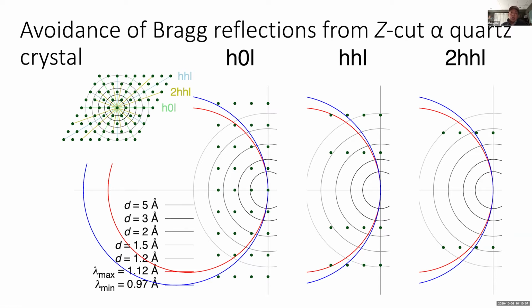So within our interest, the diffraction limit, the resolution of our protein crystal, there are only a few such potential Bragg reflections that could give us trouble. The strategy is to thread this diffraction condition, represented by the red circle and the blue circle, through this array of potential Bragg reflections. And it ended up, it will hit none of them.